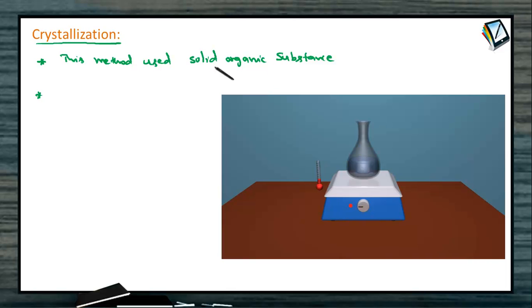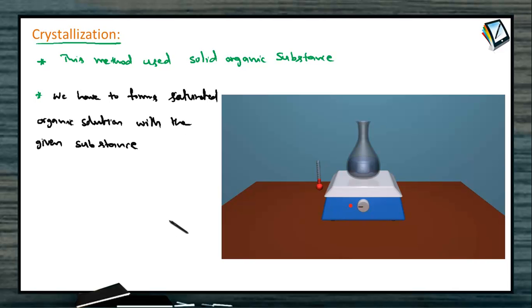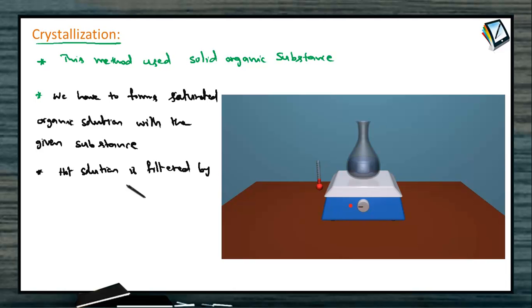According to the nature of the organic compound, we have to dissolve the solid substance up to saturation level — that means we have to form a saturated organic solution using the suitable solvent. We have to filter the solution because it has some impurities; while filtering, these impurities are removed. The hot saturated solution is filtered using suitable filter papers.